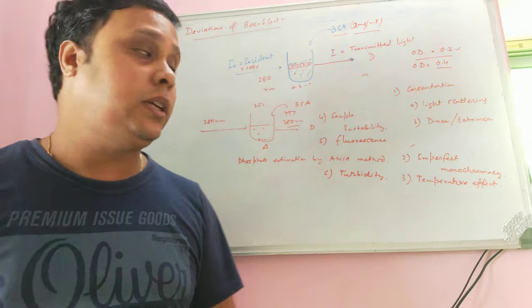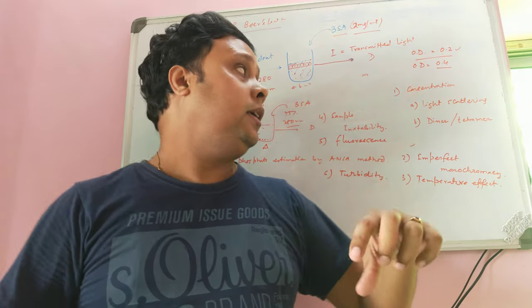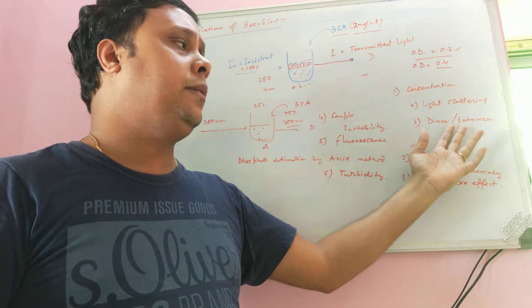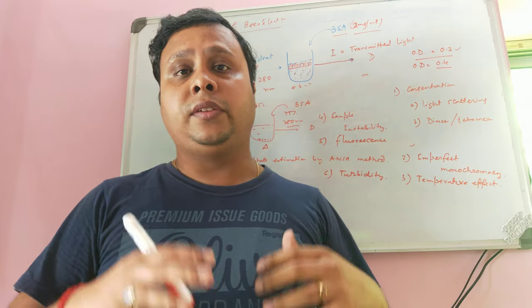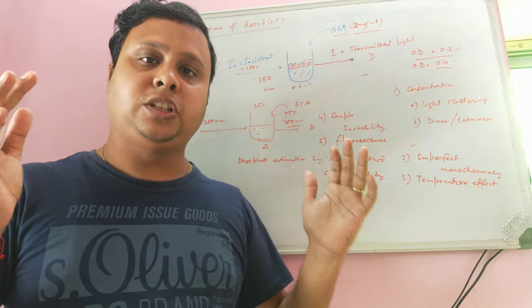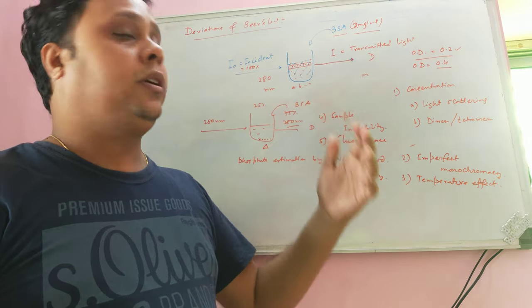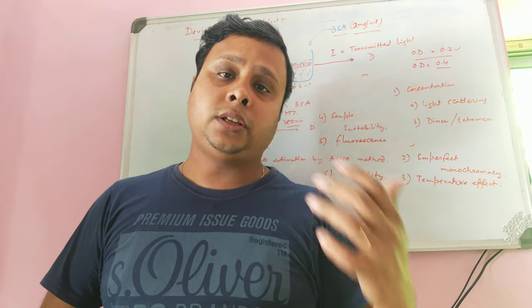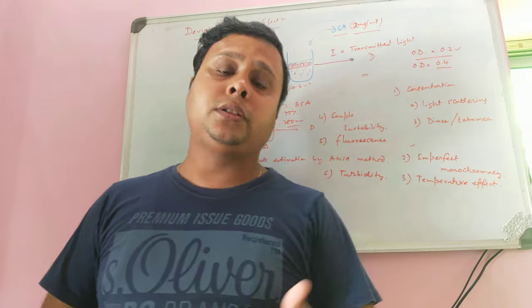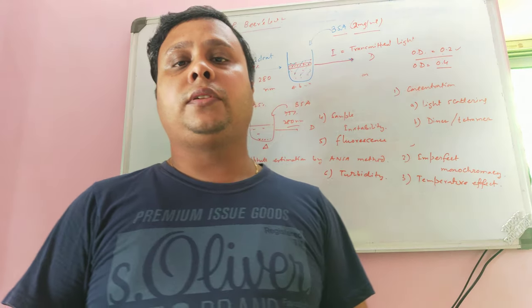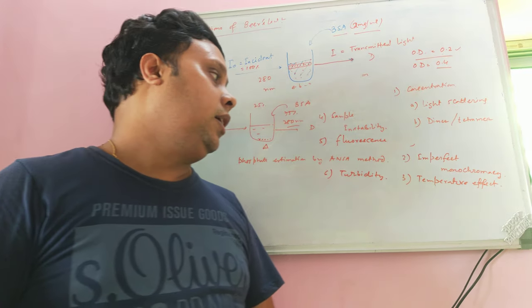In summary, there are six deviations of Beer's Law. First, concentration — at high concentration, molecules may form dimers, trimers, or tetramers, and light scattering may also occur; at low concentration, proteins may denature and absorb more. Second, imperfect monochromacy — if the monochromator sends more than one wavelength to the sample, deviations occur. Third, the temperature effect — heating a sample to develop color and then cooling before OD measurement may alter the color intensity.